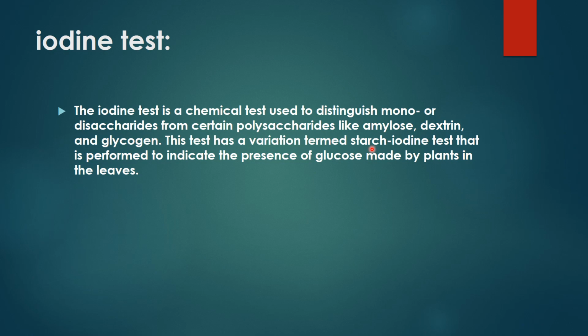It's also an iodine test, but for detecting starch. It is performed to indicate the presence of glucose made by plants in the leaves. As you know, starch is the storage form of glucose in plants.